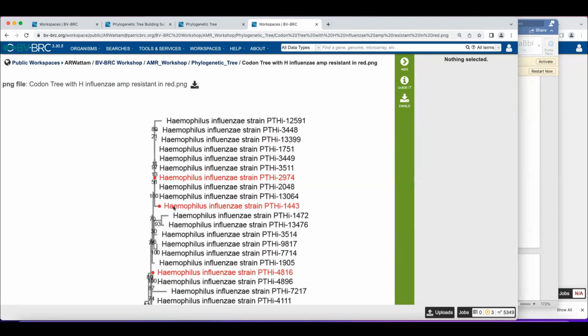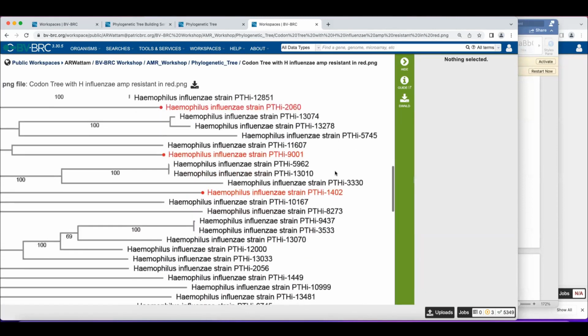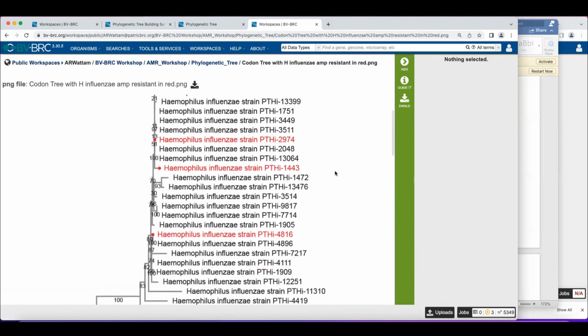Now, we do have antibiotic resistance phenotypes in the database, but as you could tell briefly when I was searching for the Haemophilus influenzae genomes susceptible and resistant to ampicillin, there was some complexity to that data structure because there are different antibiotics. That complexity makes it difficult to manifest that data directly onto a tree without a whole lot of work. Rebecca went to that work for color highlighting the nodes on this tree, but she did that manually in some other software. So we hope to be able to show antibiotic resistance as a phenotype on the tree. So that's one thing that we wanted to get.